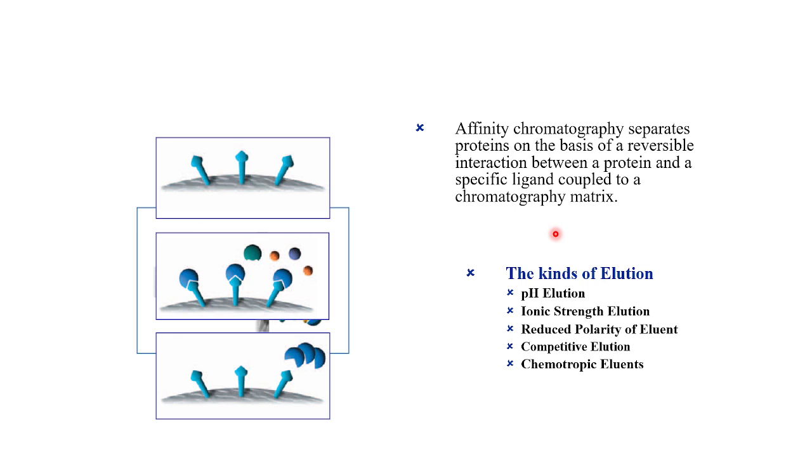Also, the charge is an internal property, but here the column is uncharged. It can be charged, because if you're using some kinds of ion, it can be charged, but we do not want to use the charge-charge interaction over here, right?